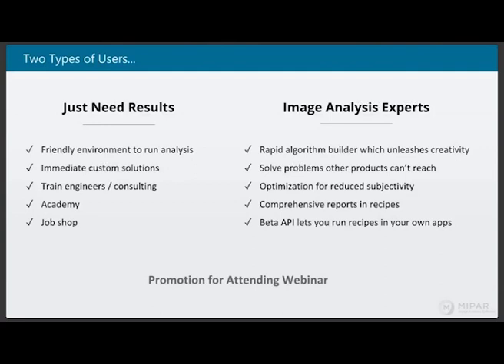I know we have even gone down to high resolution atomic imaging, where some folks like to pick out individual atoms and measure their spacing to nearby ones or measure their HAADF intensity. Certainly many TEM applications are very doable in MIPAR.